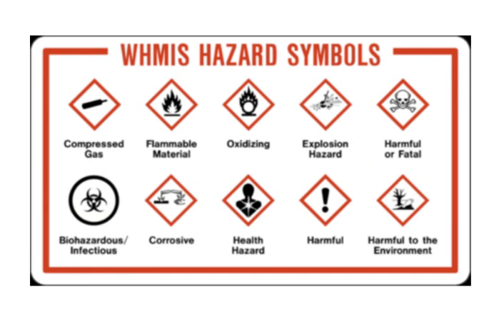So I found some pictures online. Many of them are the same though, hey? Like a compressed gas. We had one of those before. A flammable material. We had one of those before. Oxidizing material. We had one before. But they changed the symbol on one. They changed it to an explosion hazard because that just made more sense. So rather than doing dangerously reactive, they changed the symbol to literally look like a bomb blowing up in different directions, and I think more people get that intuitively, right?